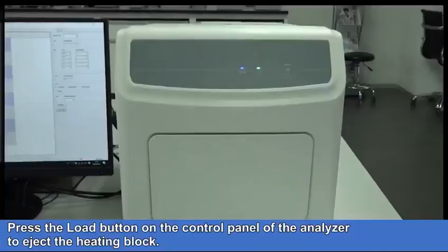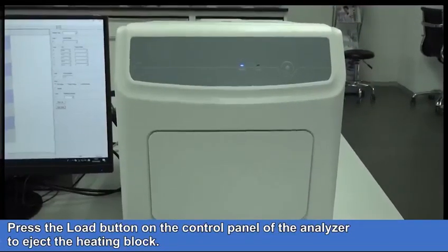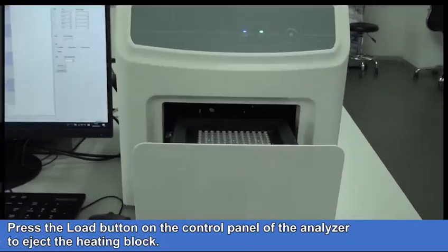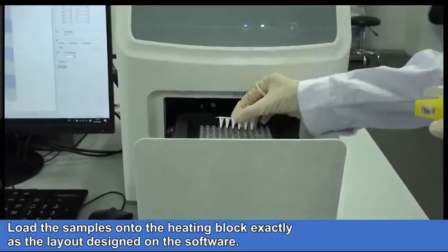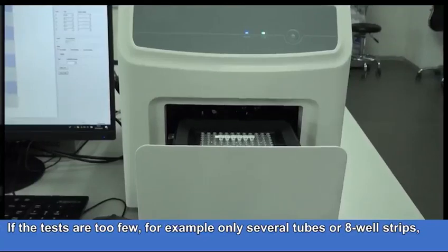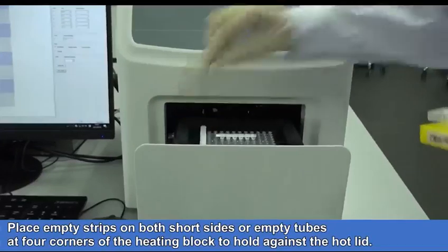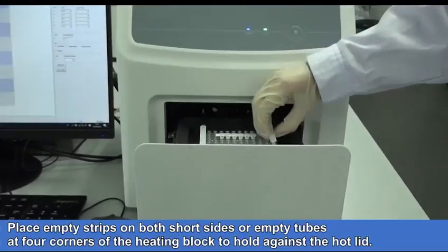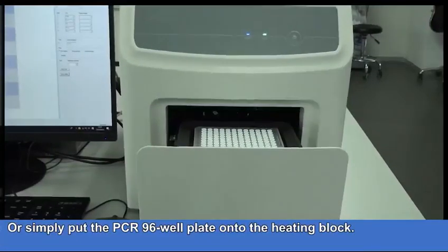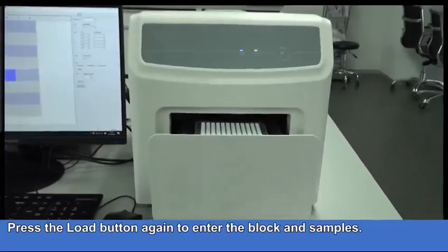Load the sample. Press the Load button on the control panel of the analyzer to eject the heating block. Load the samples onto the heating block exactly as the layout designed on the software. If the tests are too few, for example only several tubes or 8 well strips, place empty strips on both short sides or empty tubes at 4 corners of the heating block to hold against the hot lid. Or simply put the PCR-96 well plate onto the heating block. Press the Load button again to enter the block and samples.